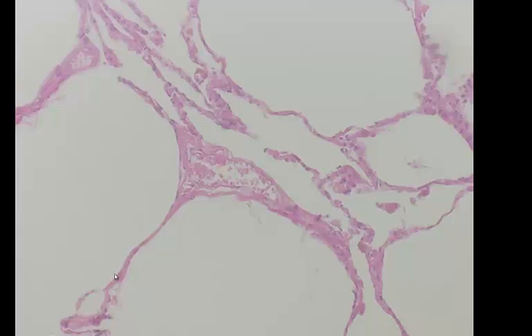And so here is simple squamous epithelium. And these are the simple squamous cells going across here. They're very flat cells, and this is in the lung. This is an alveolus in the lung, an air sac of the lung. And so the reason we want to have these flat shaped cells, here's a nucleus of one. These are the nuclei of them. They're just very flat cells going across here. We want these very flat, squished-shaped cells so we can have diffusion from this alveolus into this. This is a capillary. These are little red blood cells in here.